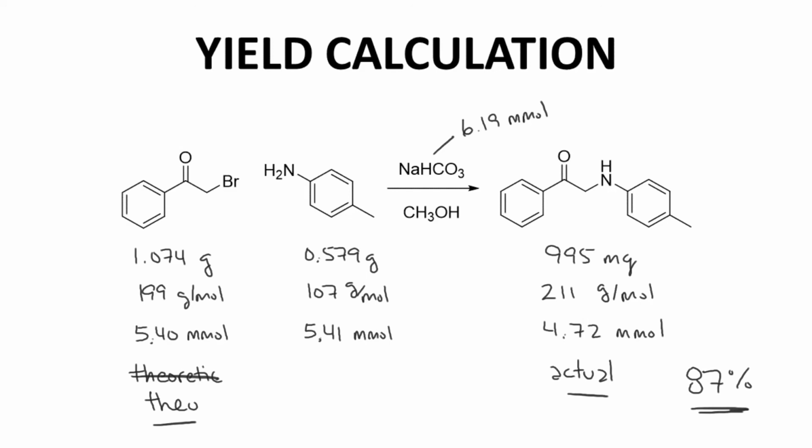Now, I don't want to be a downer here, but it's not that pure. My best guess is it's probably 90% or a little less than 90% pure. When you buy reagents from a chemical company, I'd say the standard for organic reagents is probably 98% or higher purity.